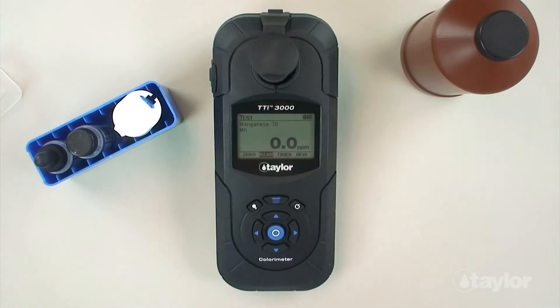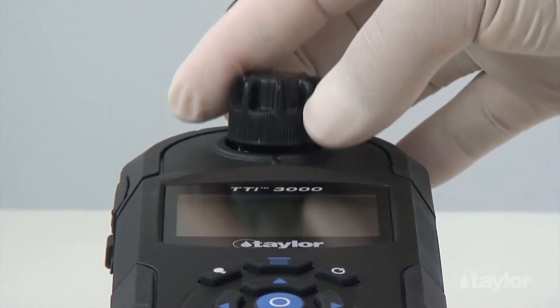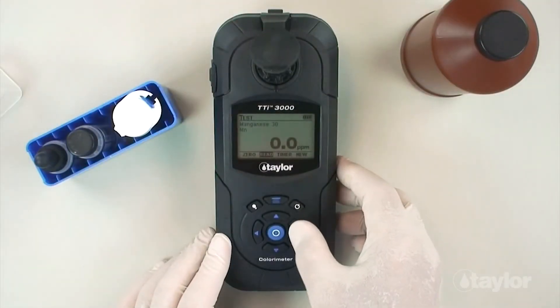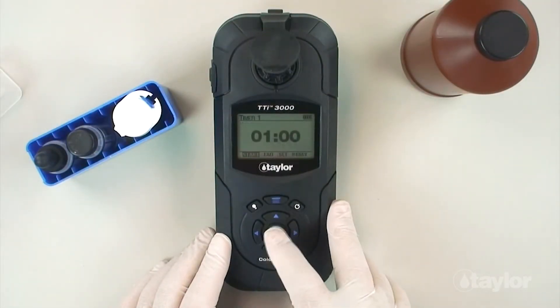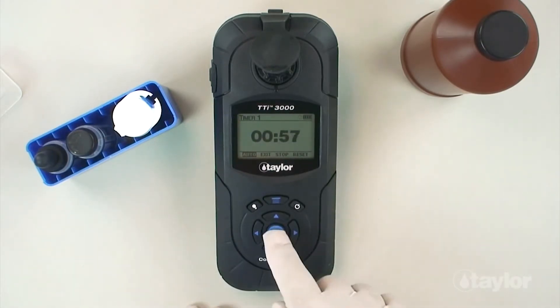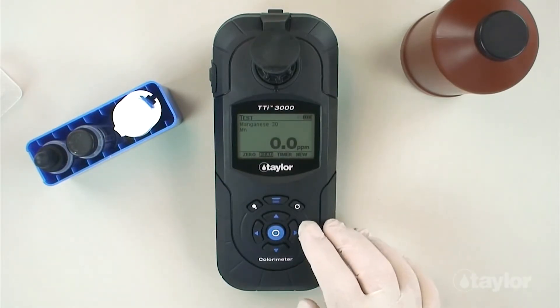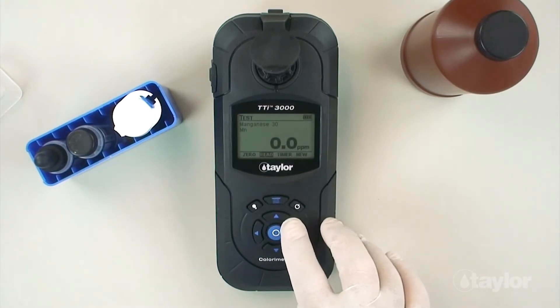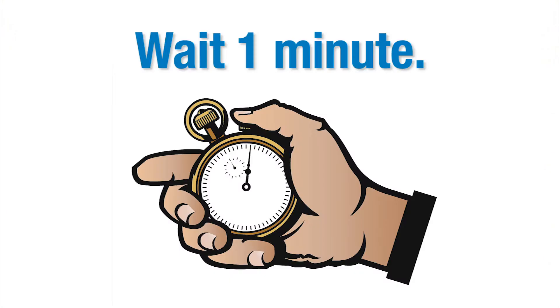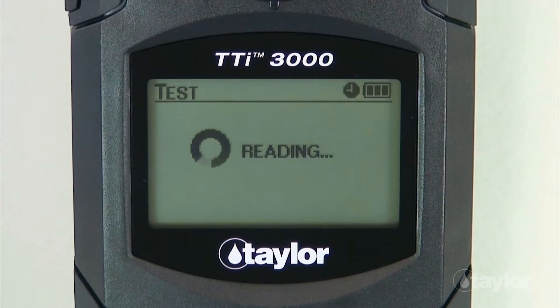Insert the sample cell into the sample cell compartment. Select timer using the scroll arrows, then press enter. Select start and press enter. A 1 minute countdown will begin. Immediately select auto and then press enter. When the timer beeps, the instrument will read the sample and the result will be displayed.